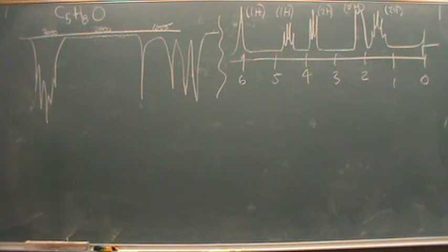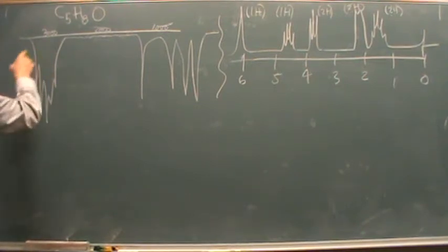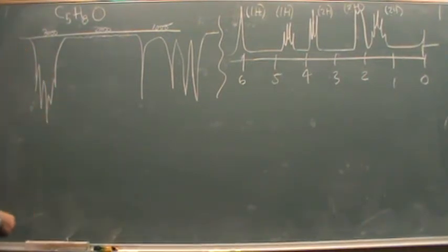Also IR and NMR. I tried my best to replicate them. The NMR is a little easier to draw. This one, you'll see it has some peaks around the 3,000 and then not much. The next peak coming up is at about the 1600 mark. And then it has a number of peaks below that.